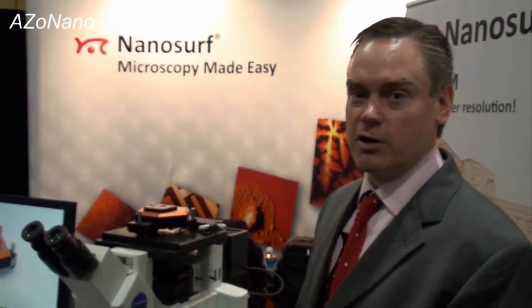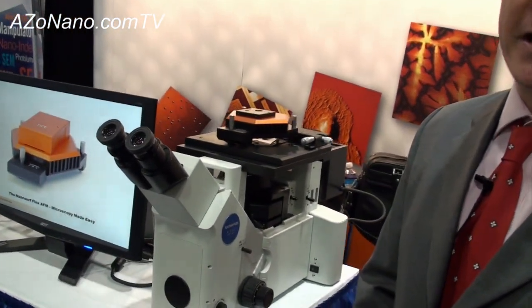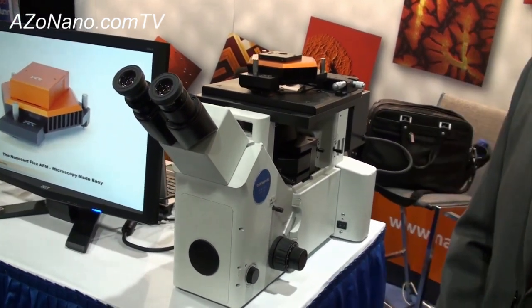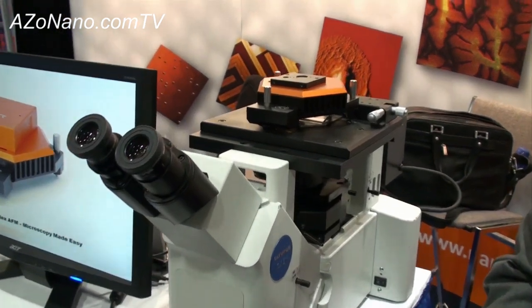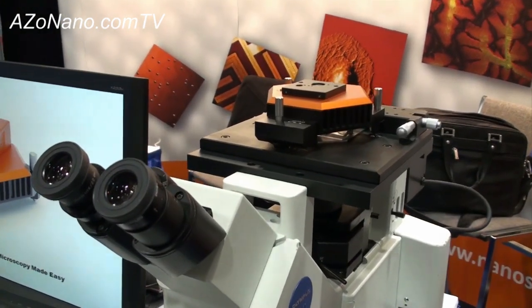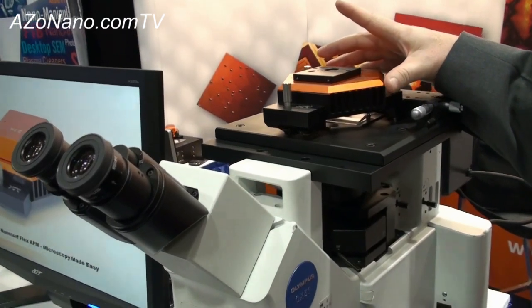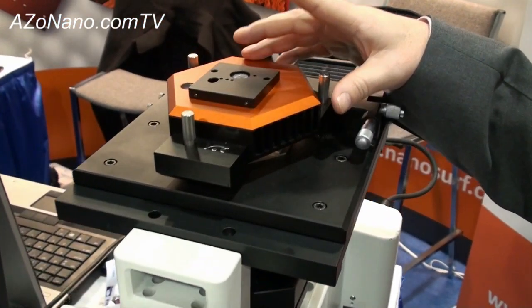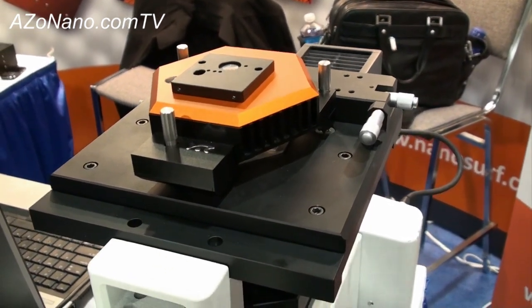The Flex AFM is one of our newer products that is targeted for research applications. Nanosurf has traditionally been a company focusing on ease of use, very often for education and teaching opportunities, and the Flex is our move into a more fully featured, robust R&D system that, keeping in line with Nanosurf tradition, is affordable and modular.